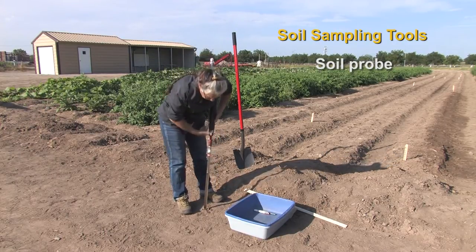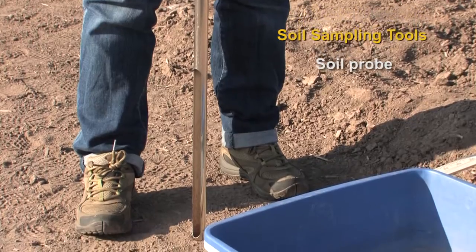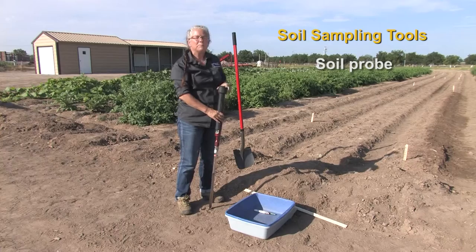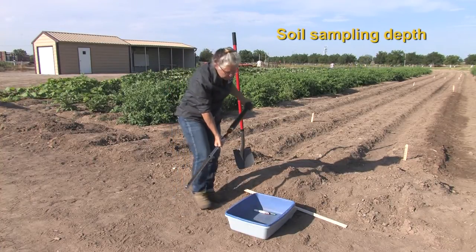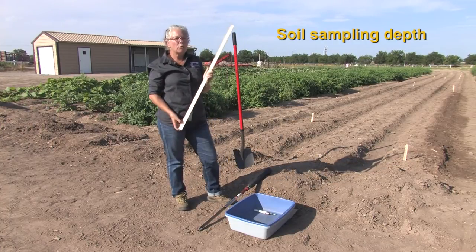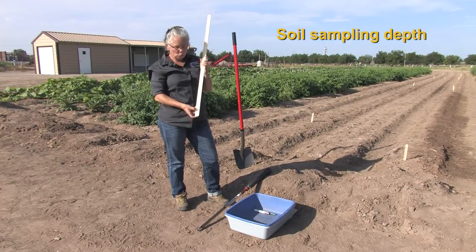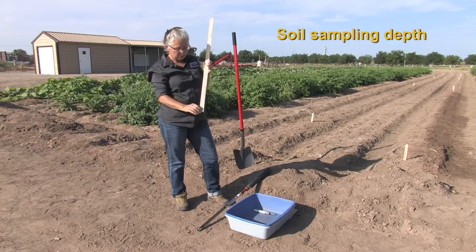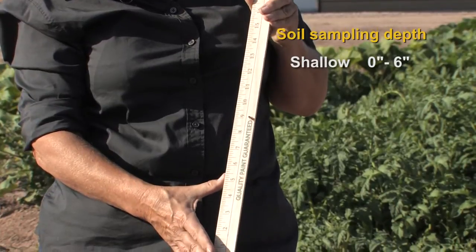You'll notice that the probe itself has a tip that's beveled and sharp that you can push down into the soil, and then with the aid of the hammer it may go into the soil more deeply. Soil sampling depth is often important and it really depends on what crop you are planting in terms of what depth you want. For something that is fairly shallow rooted, or where you're concerned about nutrition in just a fairly limited area, you might want to sample from 0 to 6 inches.